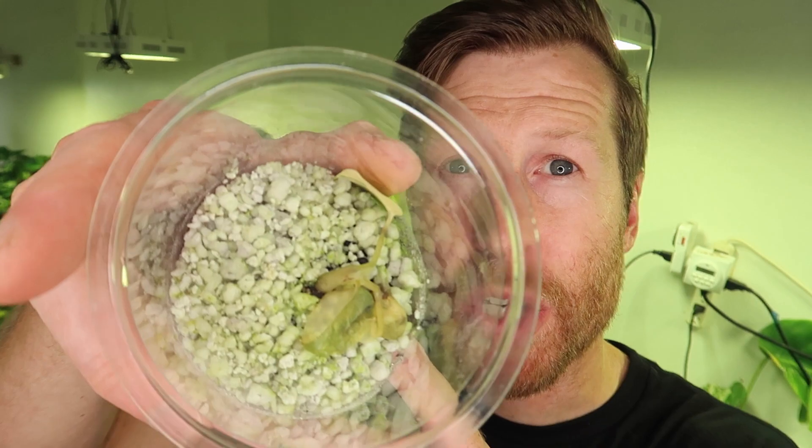This all seems really straightforward, but it's not for the faint of heart — there is a high failure rate. Here is a tycoon that simply came to damping off. I'm probably losing 10 to 30% of these plants because this process is just so incredibly delicate — it's really like taking care of a brand new baby. What typically happens is the little shoot gets taken over by a colony of fungi, bacteria, or a parasite that goes after that baby plant, which doesn't essentially have an immune system. That's how you get damping off and other fungal conditions — even pythium can attack and kill a plant.